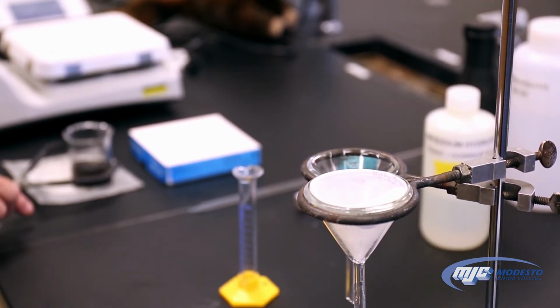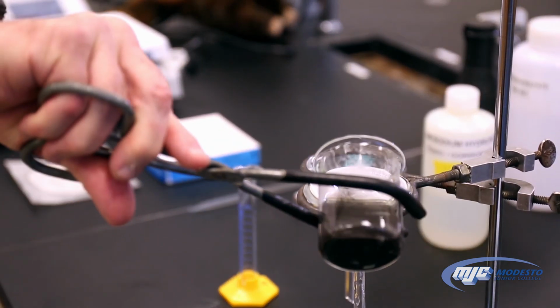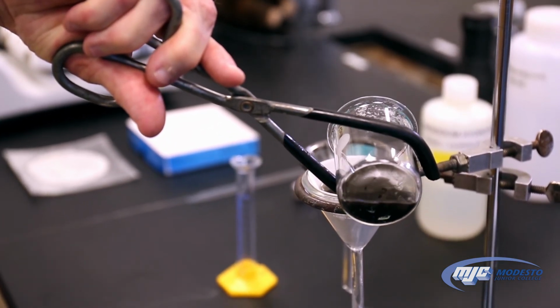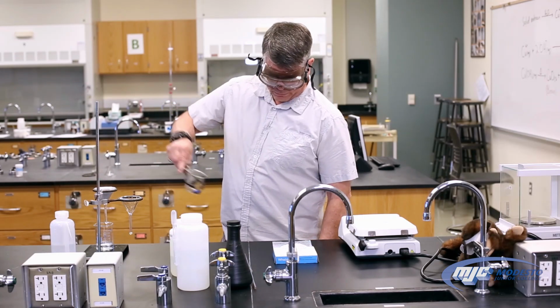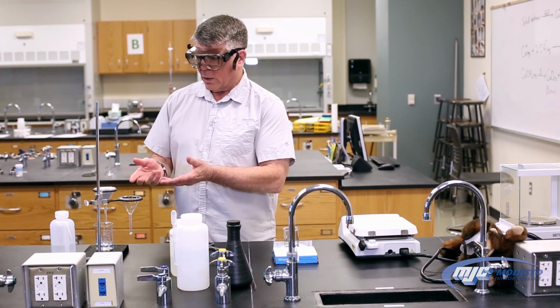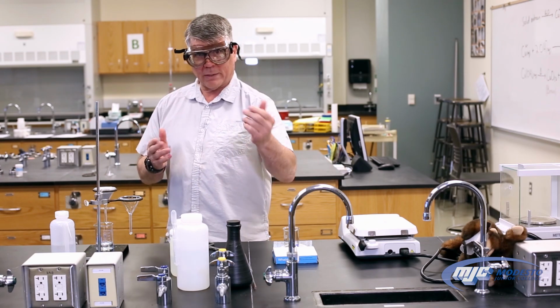Just like before, we're going to filter our copper 2 oxide. Same exact process as part A, guys. Make sure we get it all in there. Once that's finished filtering, just like before, wash it off, fold it up, put it in the oven, weigh it next week, and we're done. That's all there is to it.